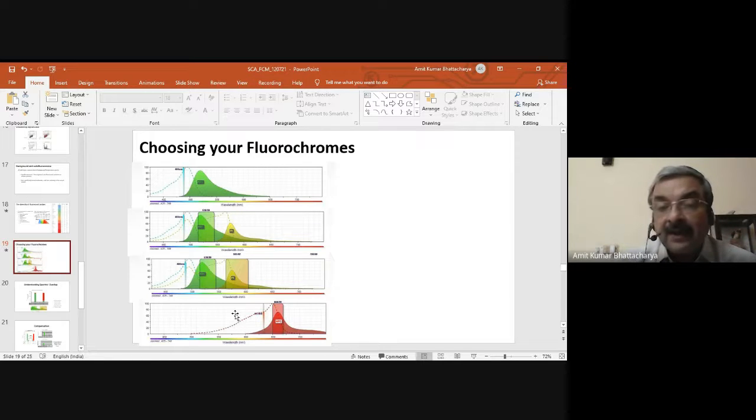It becomes a problem because as you keep increasing the number of dyes, the whole space becomes crowded, and it will be very difficult to find a pair of dyes which don't overlap, so that you collect pure signal and don't collect signal from the overlap region, because the overlap signal will always have light coming from another dye too.